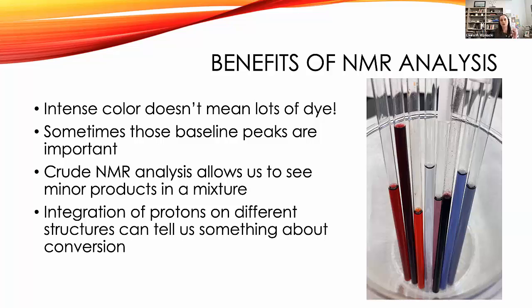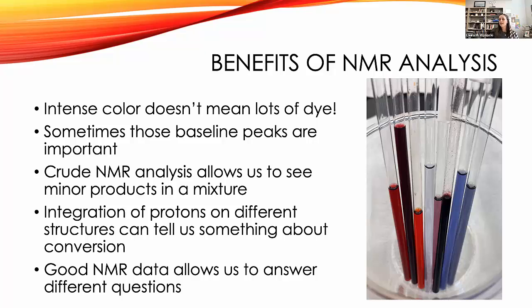I mentioned earlier the idea of integration of protons on different structures to tell us how much of each thing is, and maybe an idea of conversion or yield. And I think they see the power of NMR to be able to help us answer different questions. So just as Edward and the students were talking about in the earlier presentation, there's so much you can answer when you get good QNMR. And for students, often they're learning it just as a spectroscopy technique. This brings it into what else can we analyze as opposed to just proving we made something.